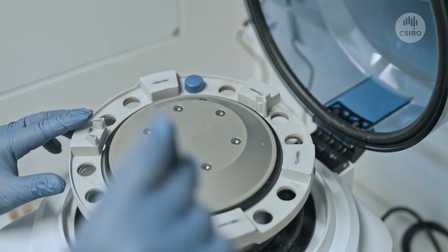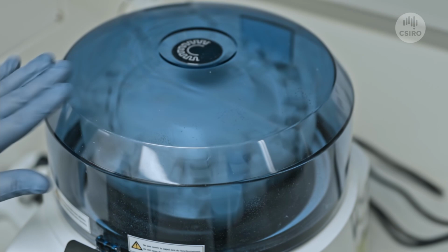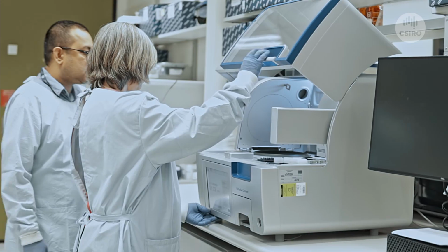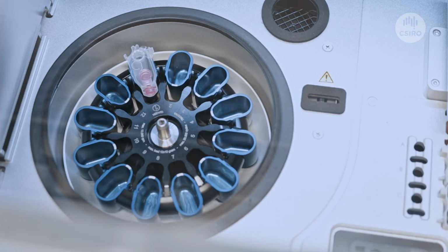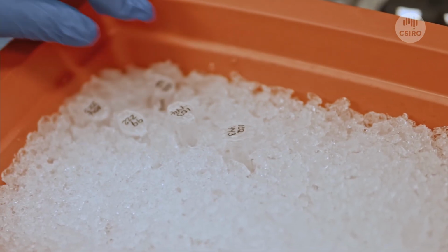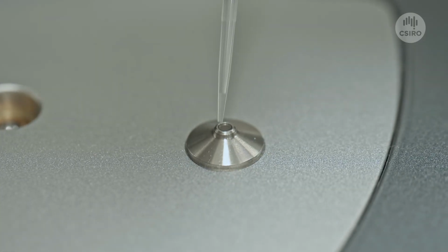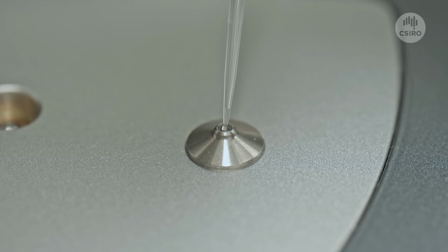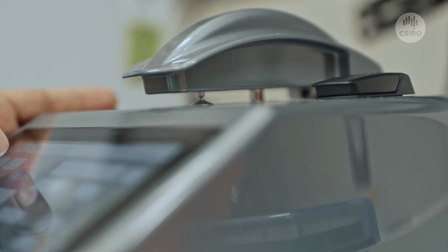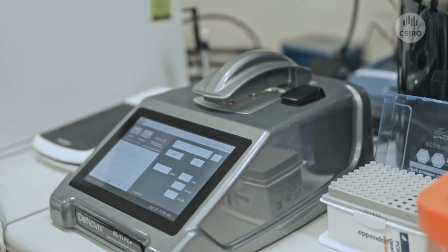After virus concentration, we extract RNA, which is a small genetic fragment of the SARS-CoV-2 virus. This fragment is not infectious. We extract RNA either manually or using robots when the sample number is high. After RNA extraction, we check the quality and integrity of RNA and make sure it's suitable for downstream RT-PCR analysis. We also use a molecular process control and a sample process control to determine recovery and PCR inhibition.